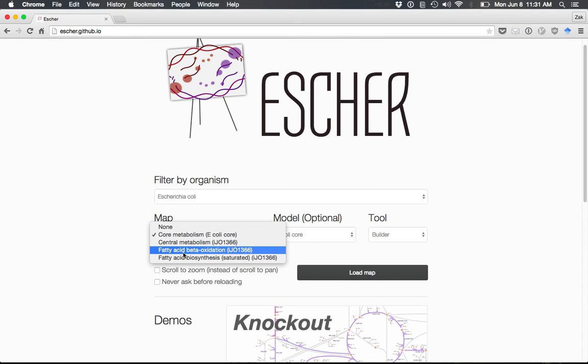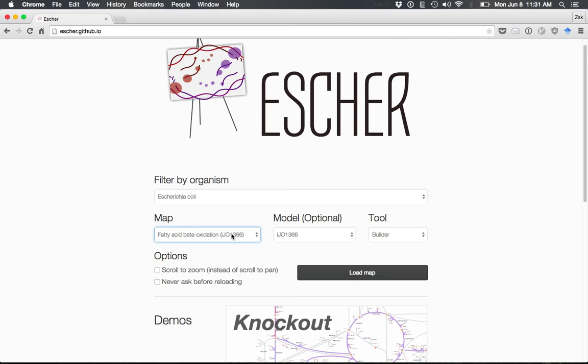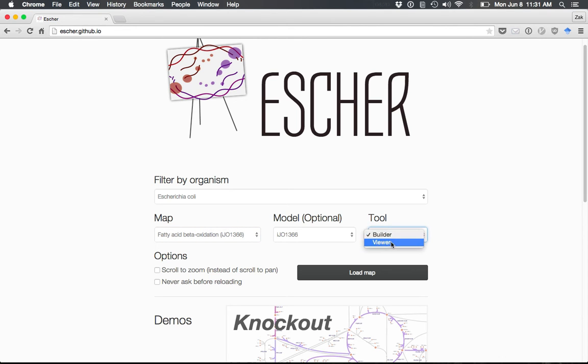For instance, we'll choose the fatty acid beta-oxidation pathway visualization, built using a genome-scale model of E. coli metabolism. We'll choose the builder, which allows us to edit the map, as opposed to the viewer which is just for viewing. Click Load Map to view the map.